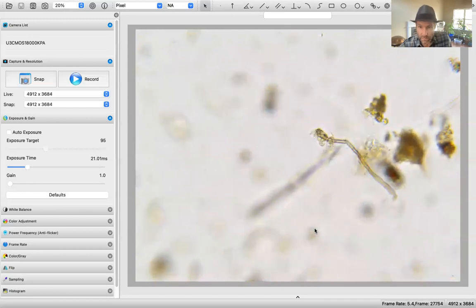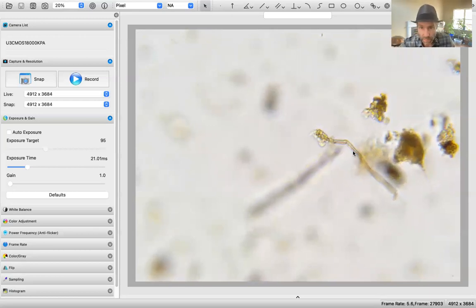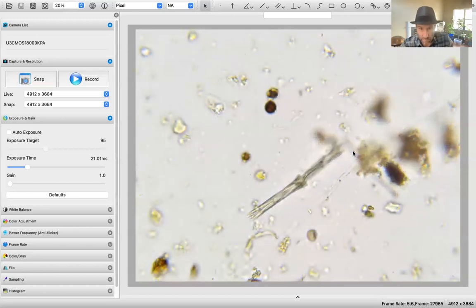And there's another one. Wait a minute. Is that a fungi there? Yeah, I see walls, but they are very weak, very thin walls. Just to give you an idea, I see a wall here, and there was a wall right there. I'm going to leave the mouse there so you guys can verify. That looks to be septa walls, but they are not strong. But I do believe that's a fungi, so we're going to be measuring that.